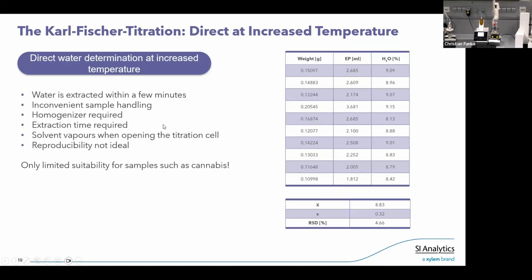But here the problem is that it's not that easy to use. When you are titrating the sample in the boiling heat, you need, before you add the sample.